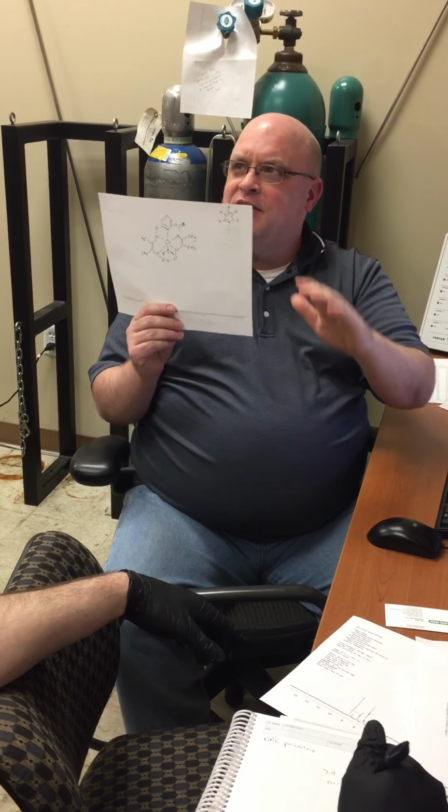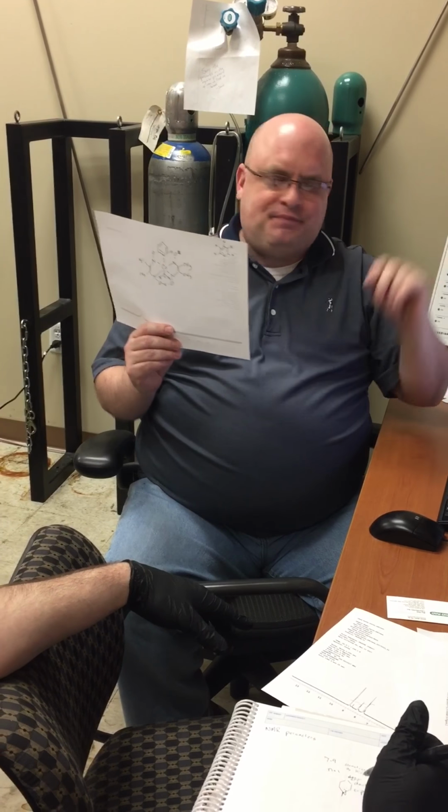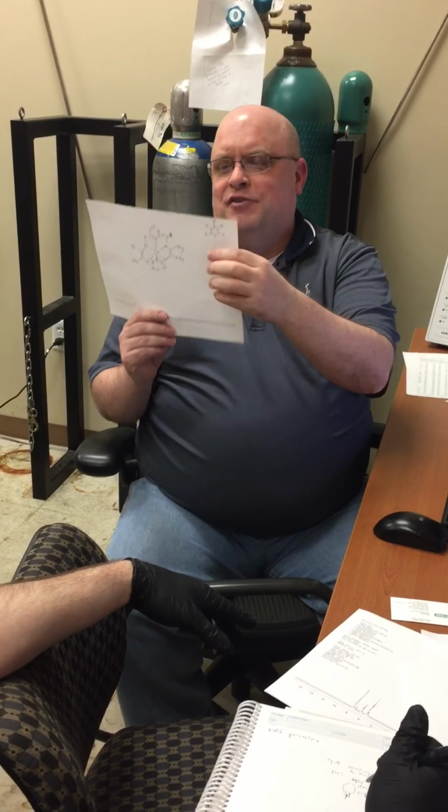Normally, you would say that as we get closer to the nitrogen, that should push it further downfield. Well, this nitrogen is actually connected to a metal, so that throws things off a little bit. So how could you tell the difference? We tell the difference by integration. One signal is made up of only one hydrogen atom. This one has 2 hydrogens, so it should have a bigger integration. That triplet should be a bigger triplet.